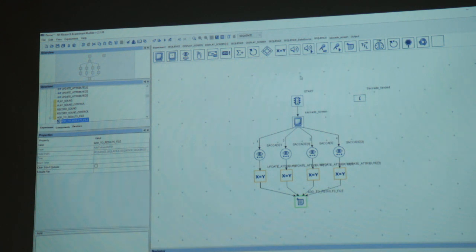So there are multiple other features that we did not speak about, but they are mostly not needed for a very simple task. The things that you would need are already discussed here. There are some few particular nodes that are specific for certain tasks. When we are running experiments and showing you particular tasks, we will discuss those nodes in more detail.